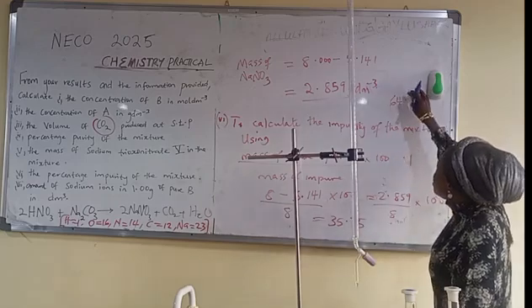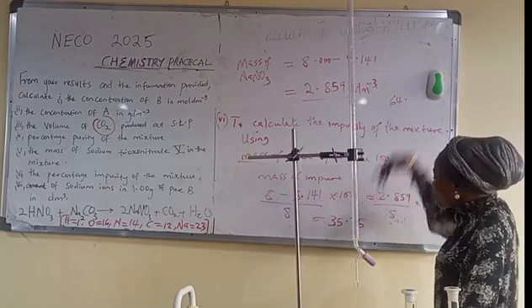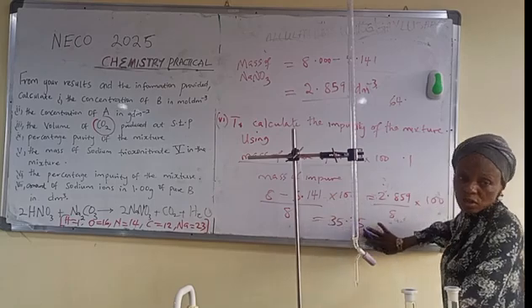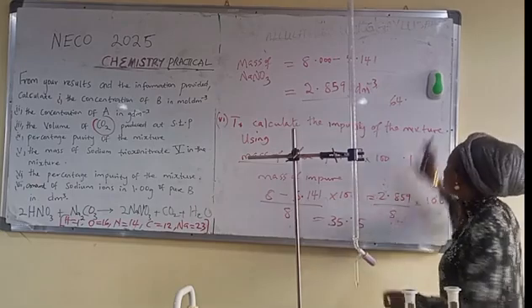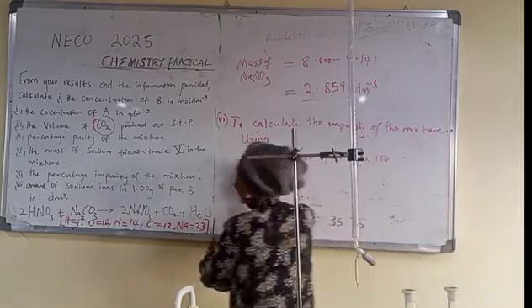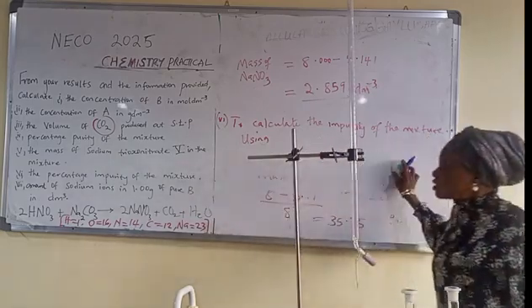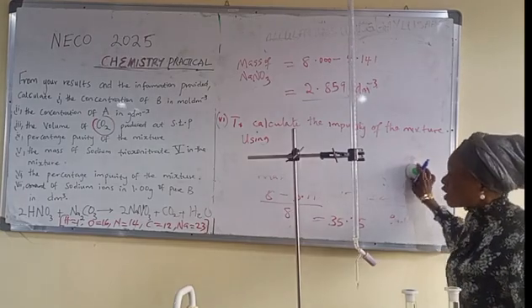By the time you add the percentage purity and percentage impurity, the sum total should give you 100%. Then you know that I'm correct. You clap for yourself. I will have excellence in my chemistry, take it to university, and keep up the good flag.